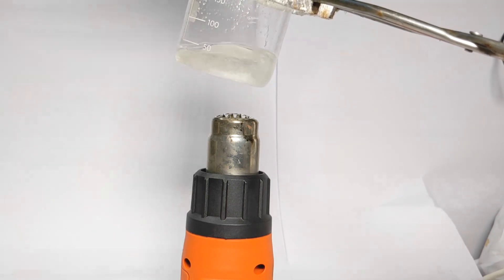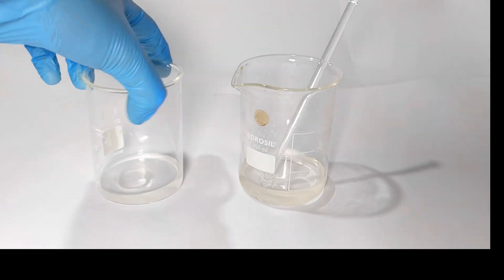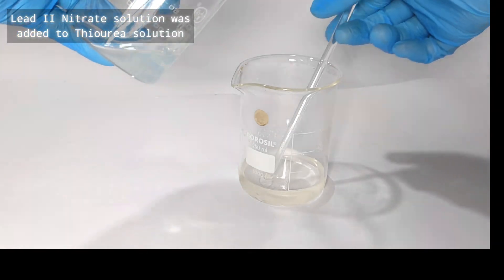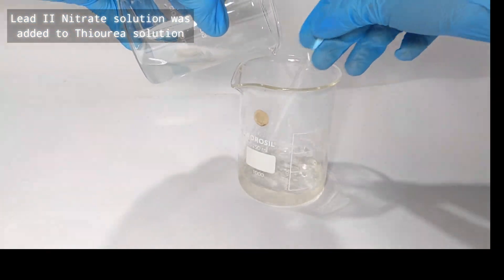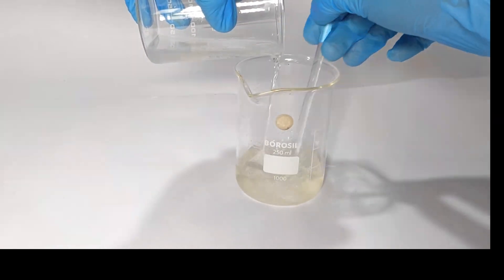Once both the solutions are clear, allow them to slowly cool down to room temperature and then add the lead(II) nitrate solution to the thiourea solution. The mixture should be thoroughly stirred while adding the lead(II) nitrate.